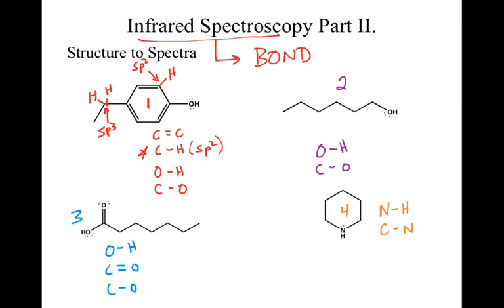Okay. The CH-sp2, interestingly enough, since we're there, only one structure has that. So I would mark that off as a very characteristic feature. If I only had 4 spectra to look at, I would look for that CH-sp2, because that's going to tell me that's structure 1. None of the other ones have that characteristic. I have my answer. I don't have to worry about the rest of the spectrum. Okay?